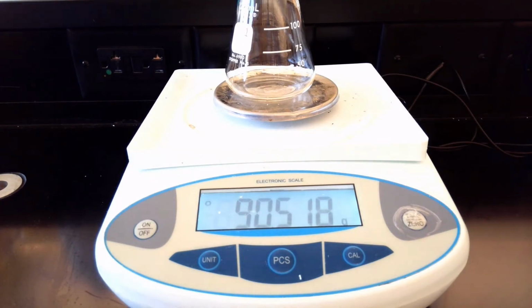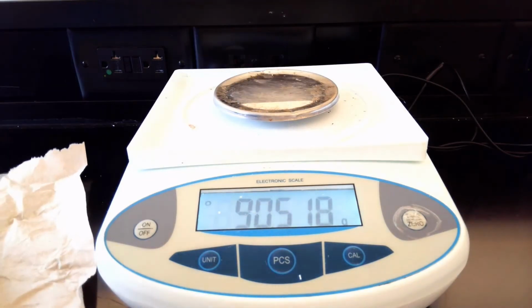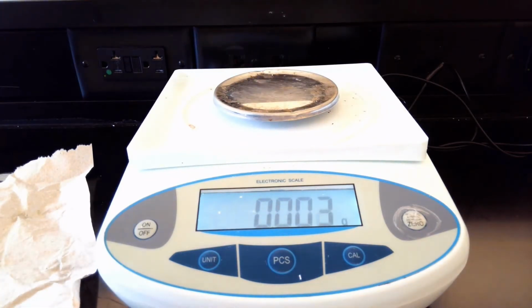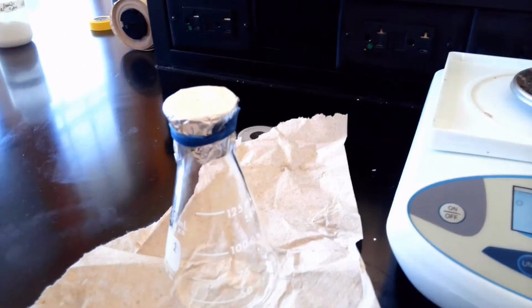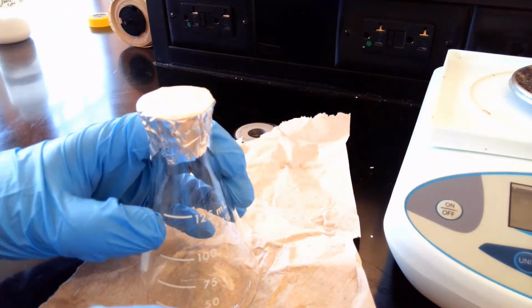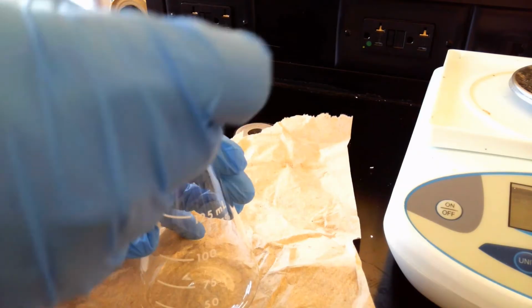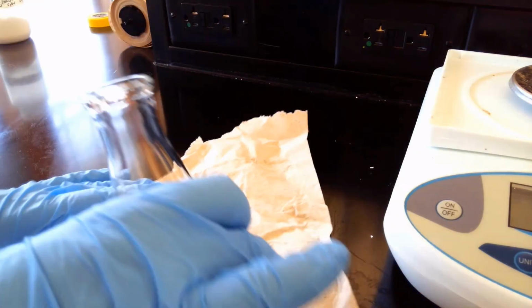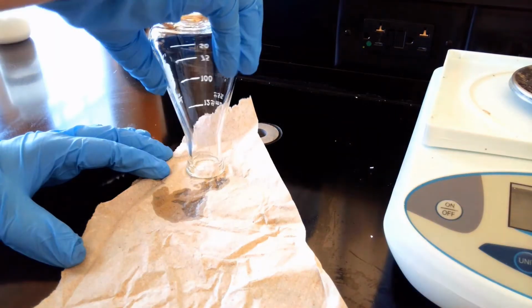So what we're going to do now is we're going to take this apart and we're going to put in another 5 mils and try it again. So I'll just take this off here. I'm going to move the camera slightly so hopefully you can see what we're going to do next. Off goes the rubber band. Remember, we're going to reuse the rubber bands and everything. We want to make sure we get all the liquid out and that we're completely dried.